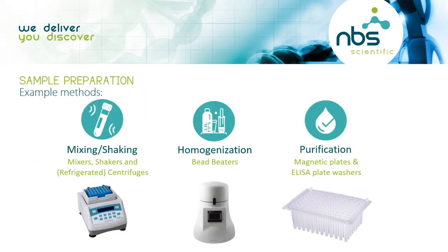Some examples of sample preparation are, of course, when you have some gentle cells, you can use gentle mixing with lysis buffer, and then you get your target sample retrieved. If you have some harder samples to prepare, for example, plant seeds or plant material, you can use homogenization.